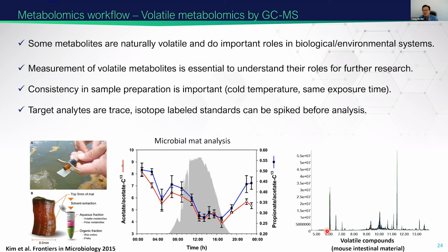Also, we can inject samples for a lot of microbiome research. We can get fecal or intestinal material, mix it with methanol, and just inject it into the machine, and we can measure a lot of short-chain fatty acids or other smaller volatile metabolites as is.